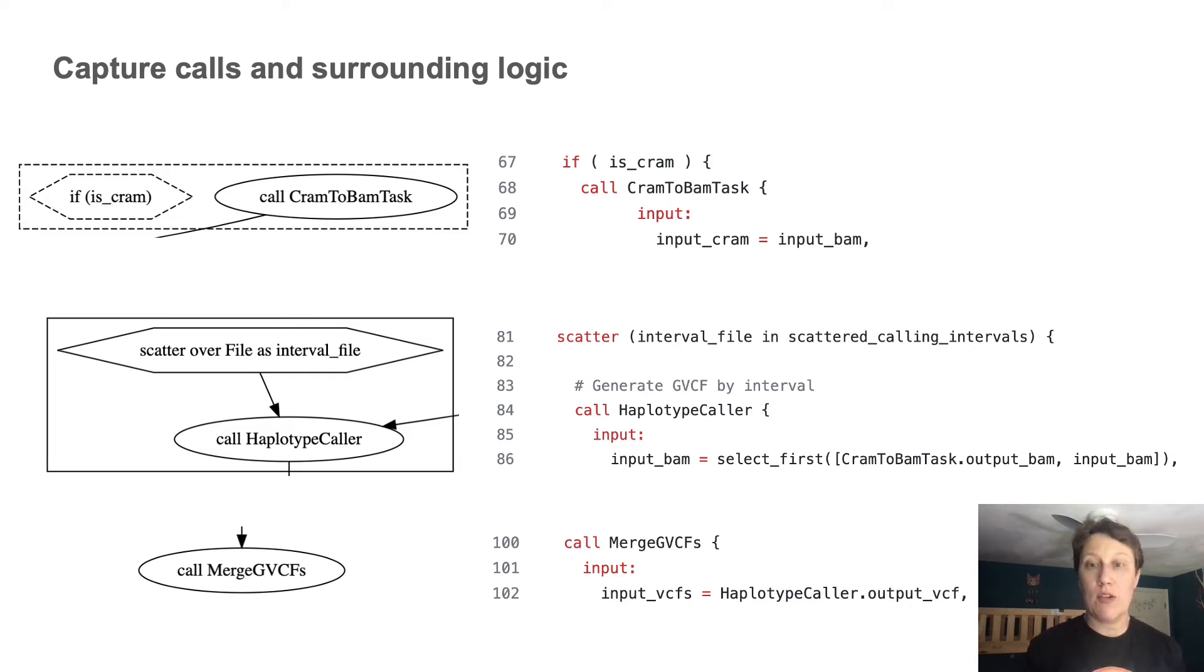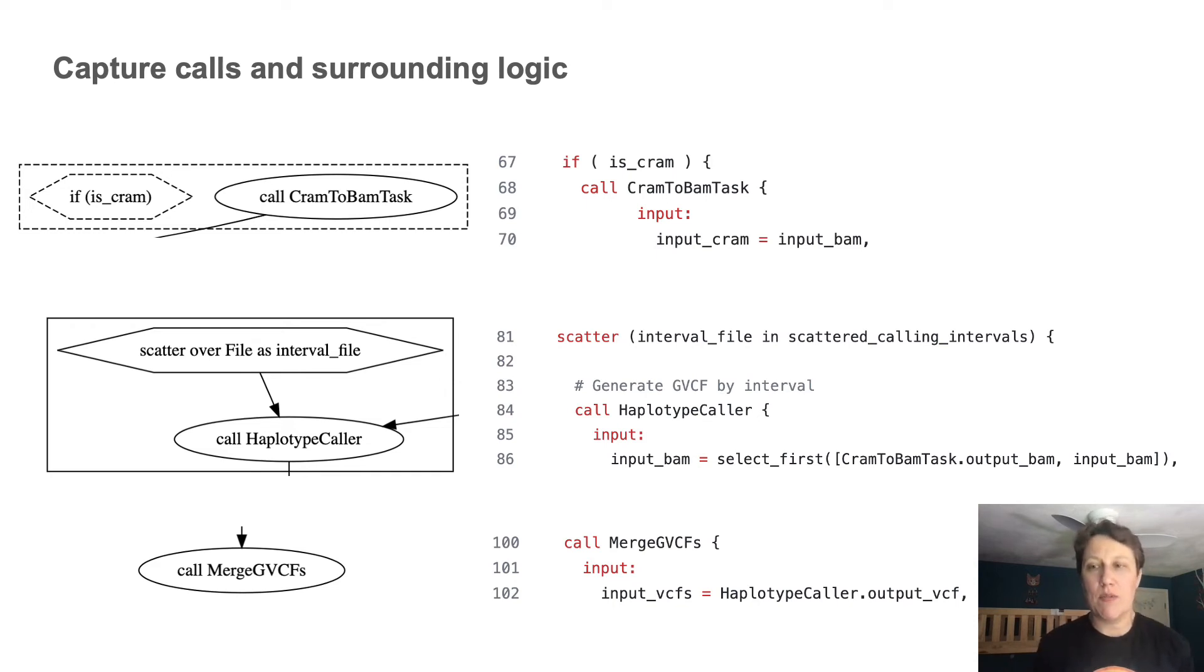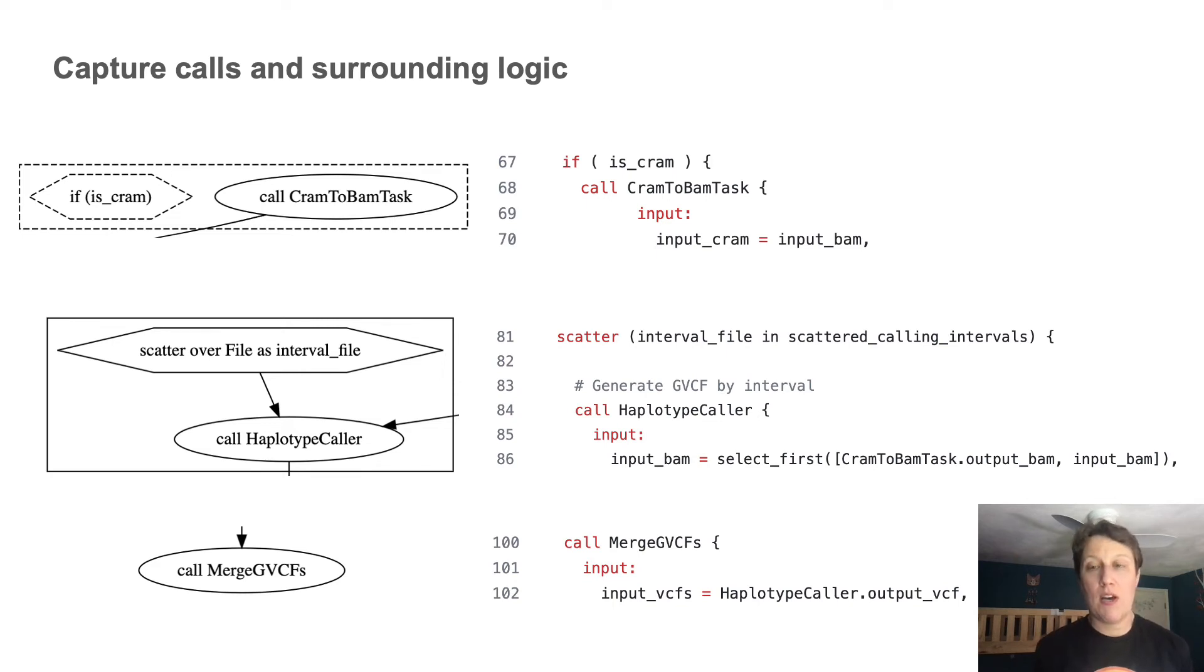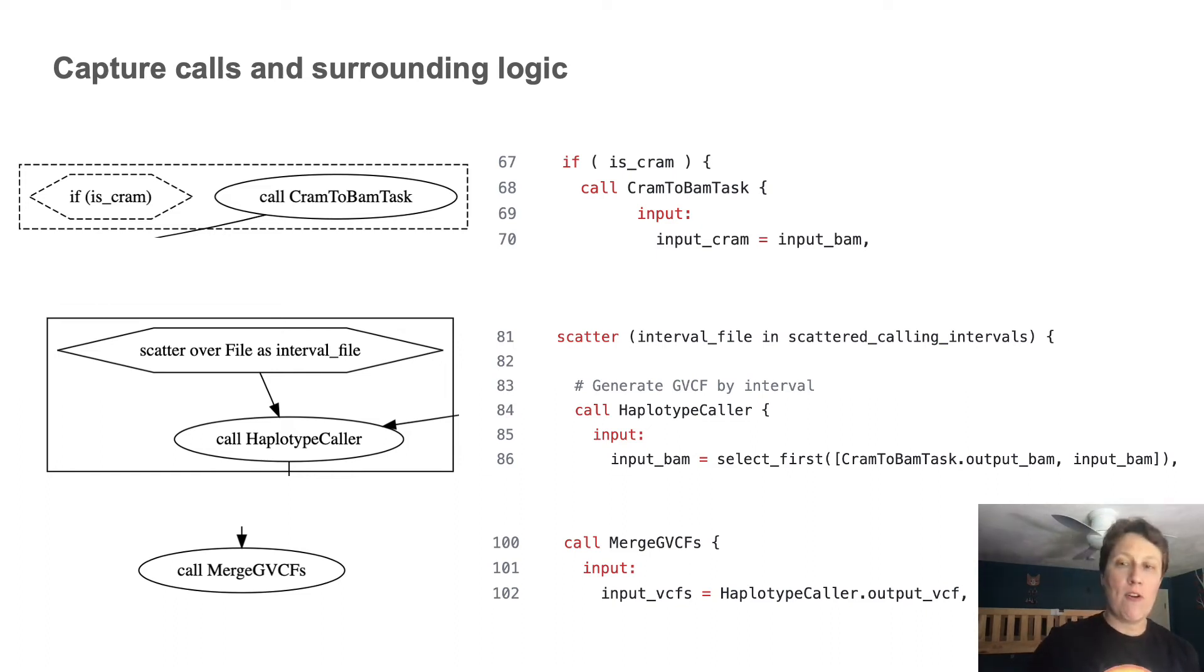Now, if I'm curious about the specific syntax of those controls, I can look up the relevant terms in the WDL language specification on GitHub, which includes explanations and examples of their expected behavior. And finally, I can also see how the calls are connected by their inputs and outputs. As in the case of the merge VCFs call, taking as input the outputs from the haplotype caller call.